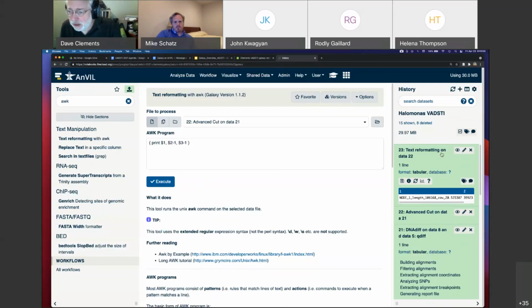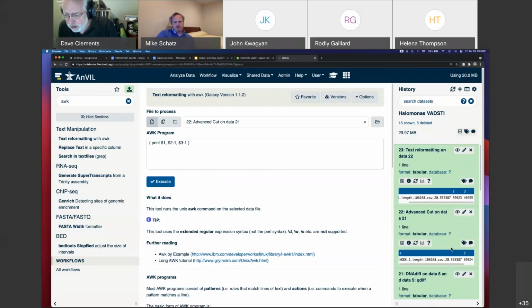Okay. So here we go. We got this. Let's take a look. This is the output of awk. It's got 39923 and 40255. I'm going to open this guy. We started with 24, we're now at 23. We started at 56, we're now at 55. So it looks like it worked. Okay. I could run table compute now, and I should get exactly the same results here. In the interest of time, I'm not going to do that.